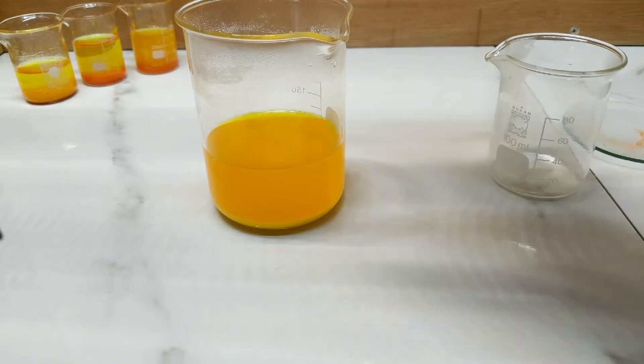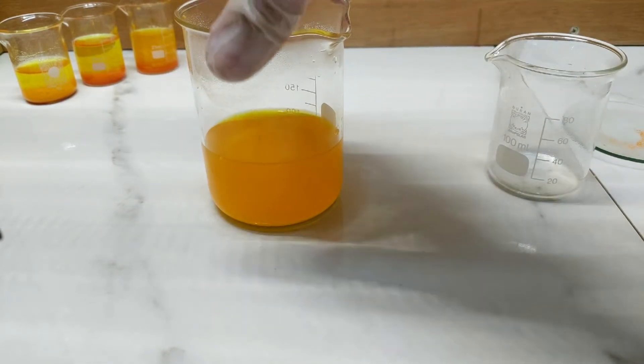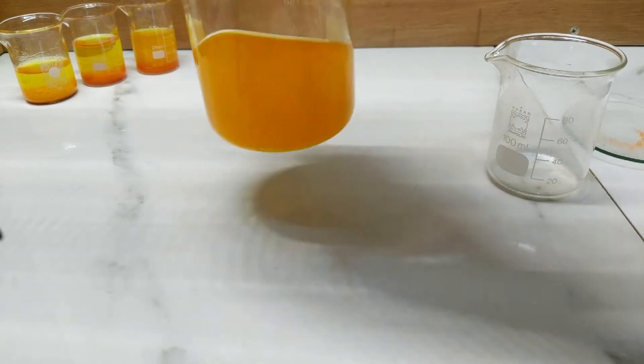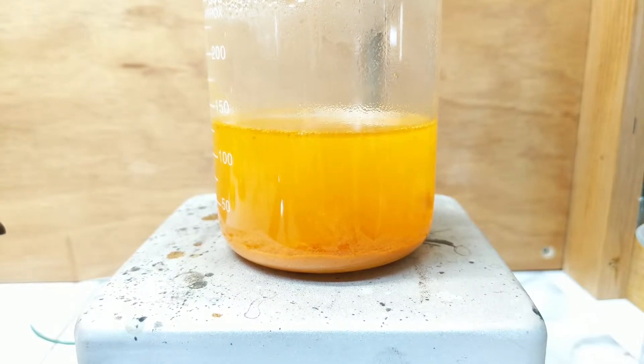So immediately we have a yellow precipitate form. I think I may need to heat this a little more in order to get it to do the thing that we want. I thought this looked rather interesting — these little puffs of the chrome pigment just boiling up from the bottom there, just cooking away, working their way towards a more orange colour.